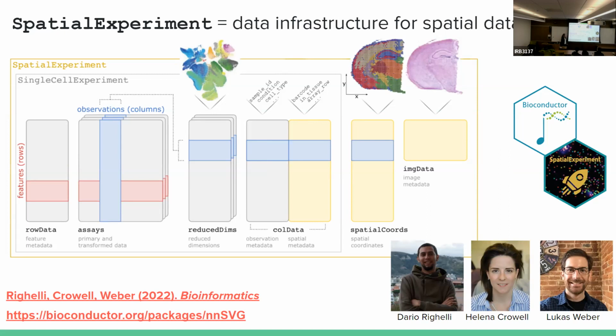The SpatialExperiment class is essentially an extension of the SingleCellExperiment class, whereby in addition to the counts that you might have in an XY plane for a set of features, row data, column data, and reduced dimensions, you also have a space to place the XY coordinates for each of the observations, and a space to store all the images that your experimenter, your collaborators generated. So now we have this really nice class to be able to work with and generate new methods to analyze these data.